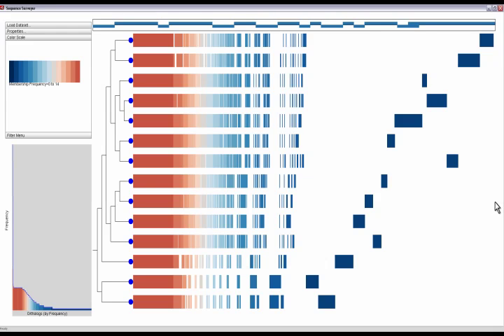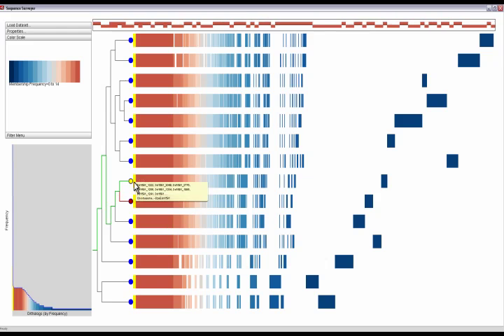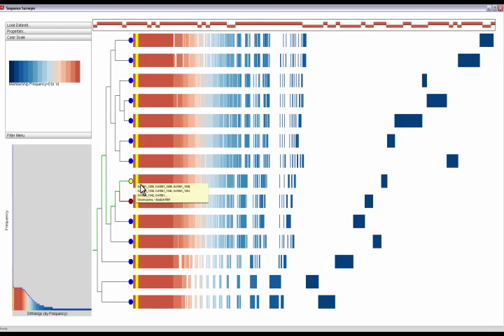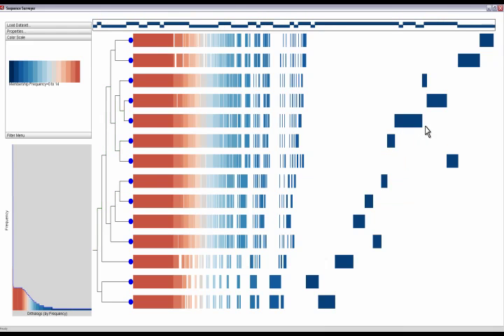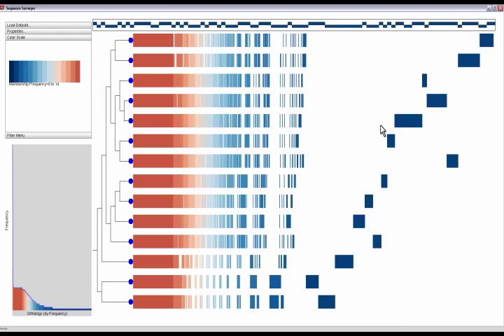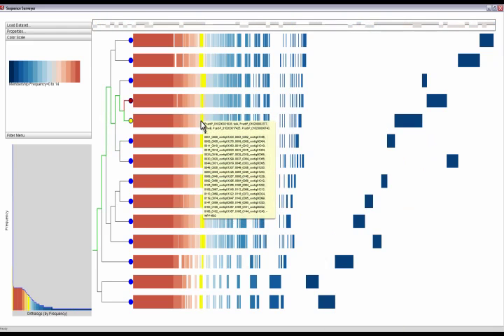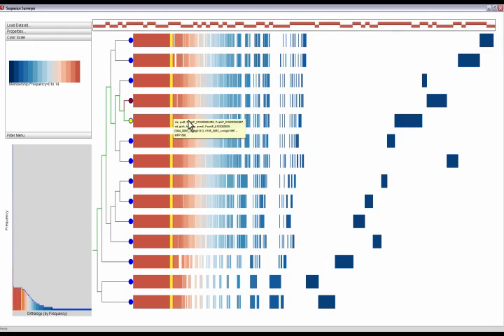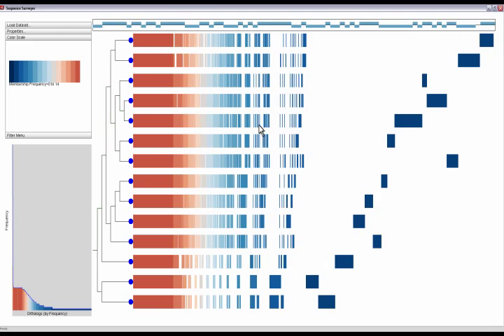Here, we have reordered the genes by frequency. More common genes are moved to the left, less common ones are on the right. This view emphasizes which genes are shared among subsets of the genomes. It shows information independent of the physical location of the gene.